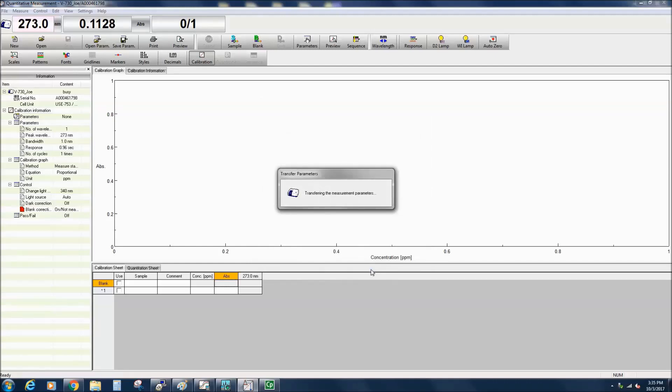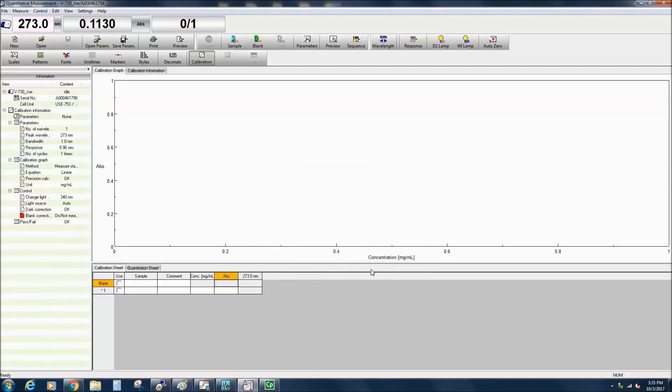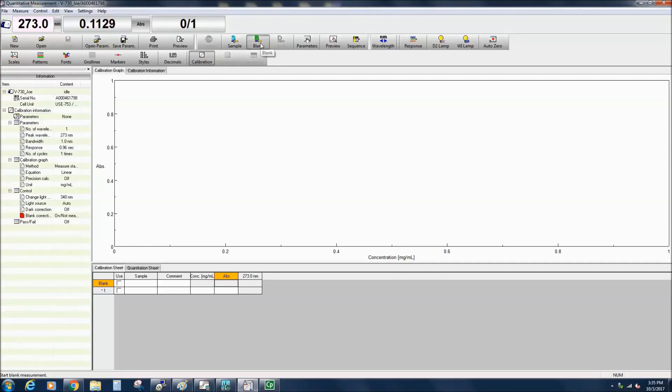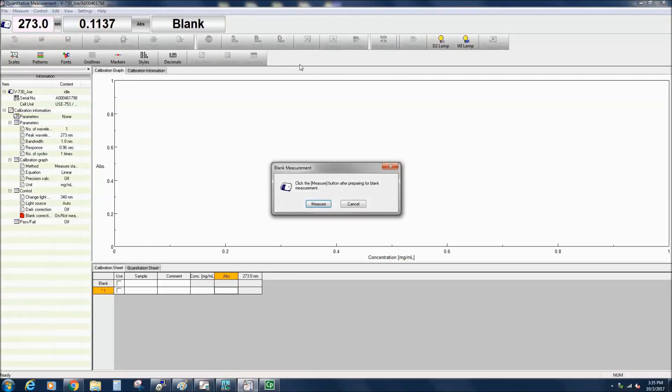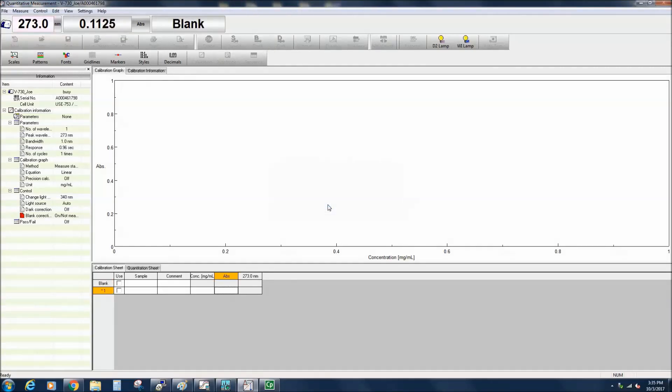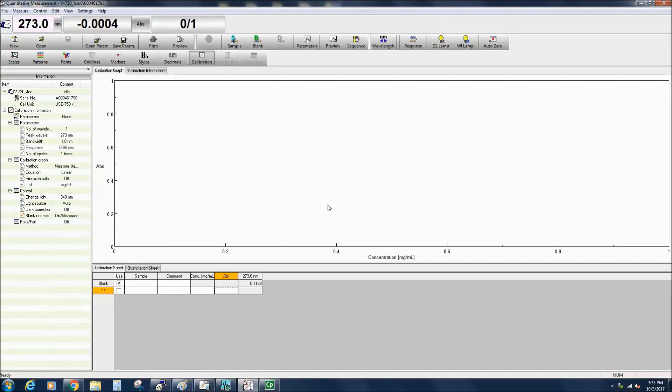To begin creating a calibration curve, place the cell filled with a solvent into the cell holder and select the blank icon in the menu toolbar. Then select Measure. The absorbance value at the peak wavelength specified will be automatically entered in the calibration sheet under the peak wavelength column in the blank row.